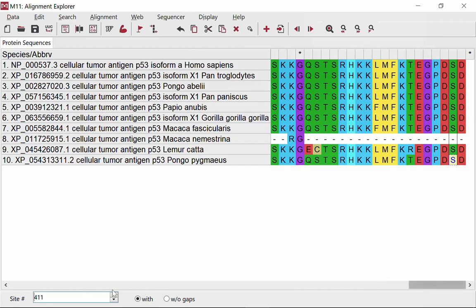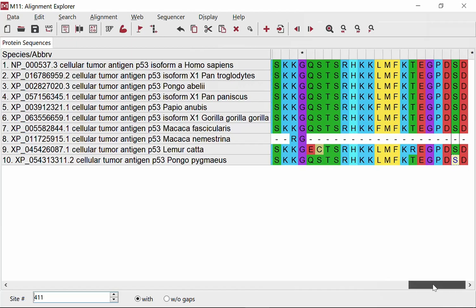Nice and easy. In this case, it does it fairly quickly because you're dealing with only a few hundred letters ultimately. Whereas with the mitochondrial DNA, it might take several minutes. So be patient and wait around, do something else in the meantime.